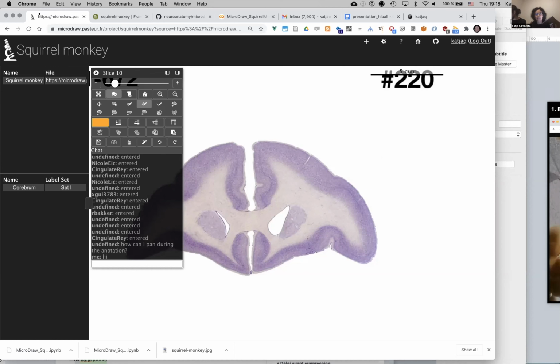There may also be a confusion with the line drawing tool. There is a line drawing tool, and these lines can't be closed. It's for when you have cortical boundaries, when you want to delineate columns or areas in the cortex, and not a cortical outline where you want to enclose a region. That one is meant to not become a closed path. So it depends on which tool you chose. It may not be possible to join them.